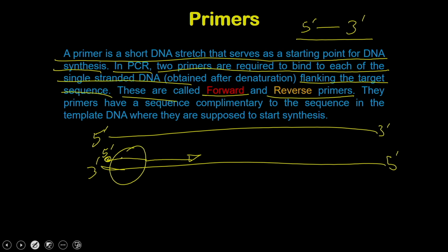This primer is called the forward primer, whereas the primer which binds onto the reverse strand is called the reverse primer.